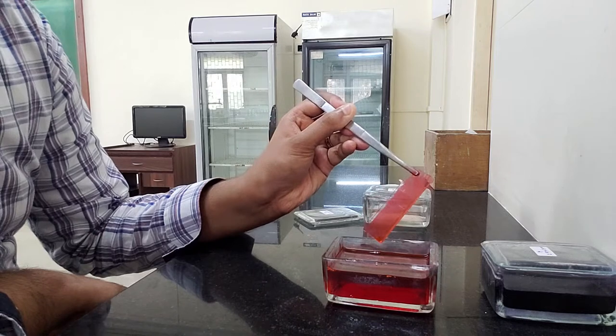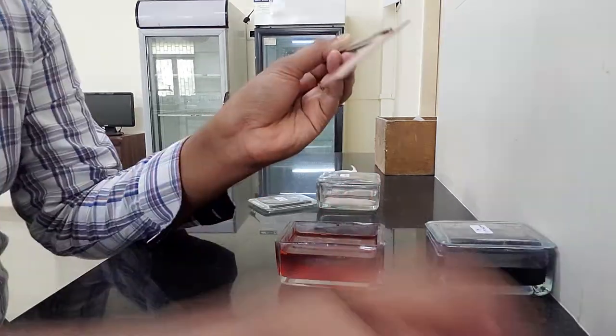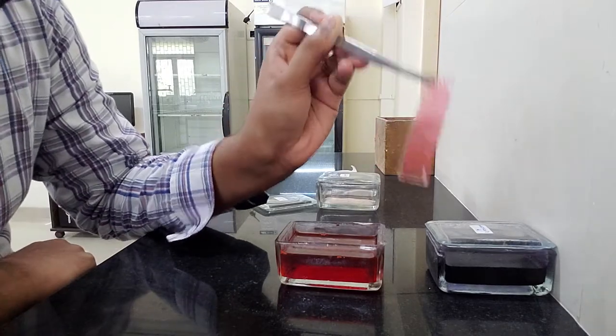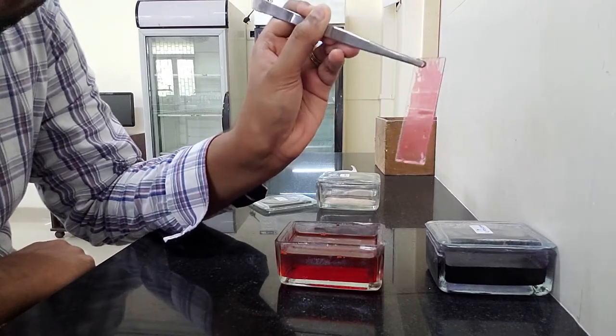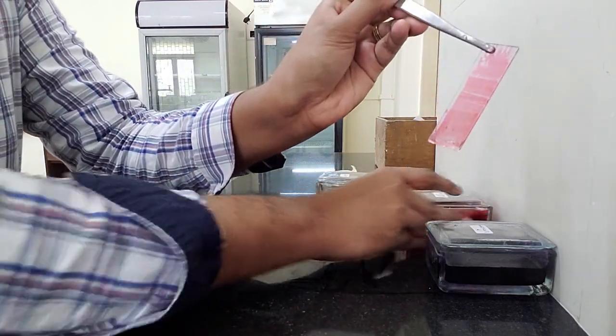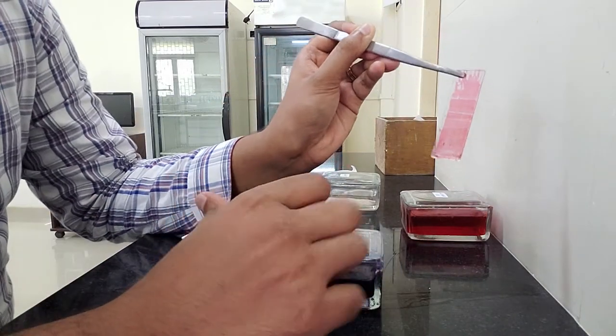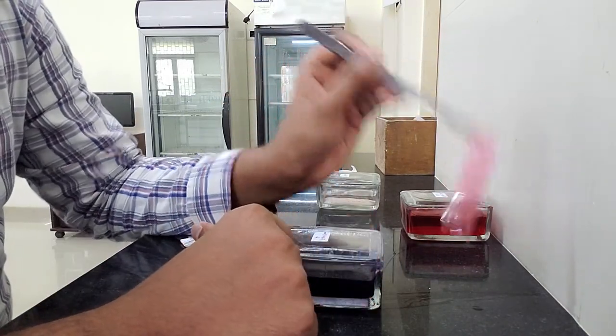Then you have to gently wash it under the stream of water. After washing under tap water, this is how it's going to look like. I'm done with Field stain B, so I'm going to keep it aside and now I will take up Field stain A.